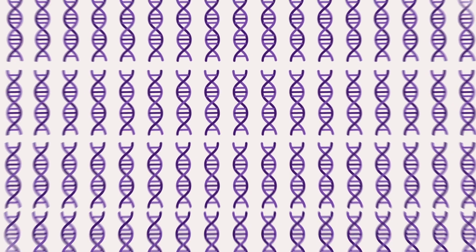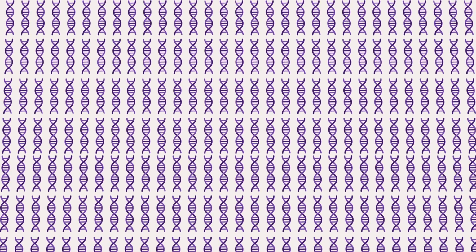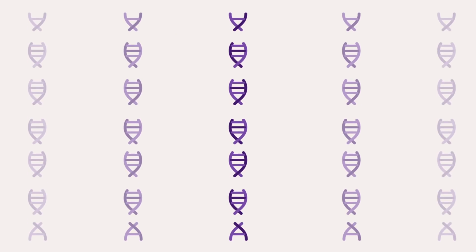This copying phase takes up to 24 hours to make sure that we've got enough copies of your DNA for genotyping. And then we do something that might seem a little bit counterproductive. Chop up your DNA. Your DNA needs to get broken up into fragments, into little pieces, and then we end up with bajillions of little chunks of your DNA in a tube.